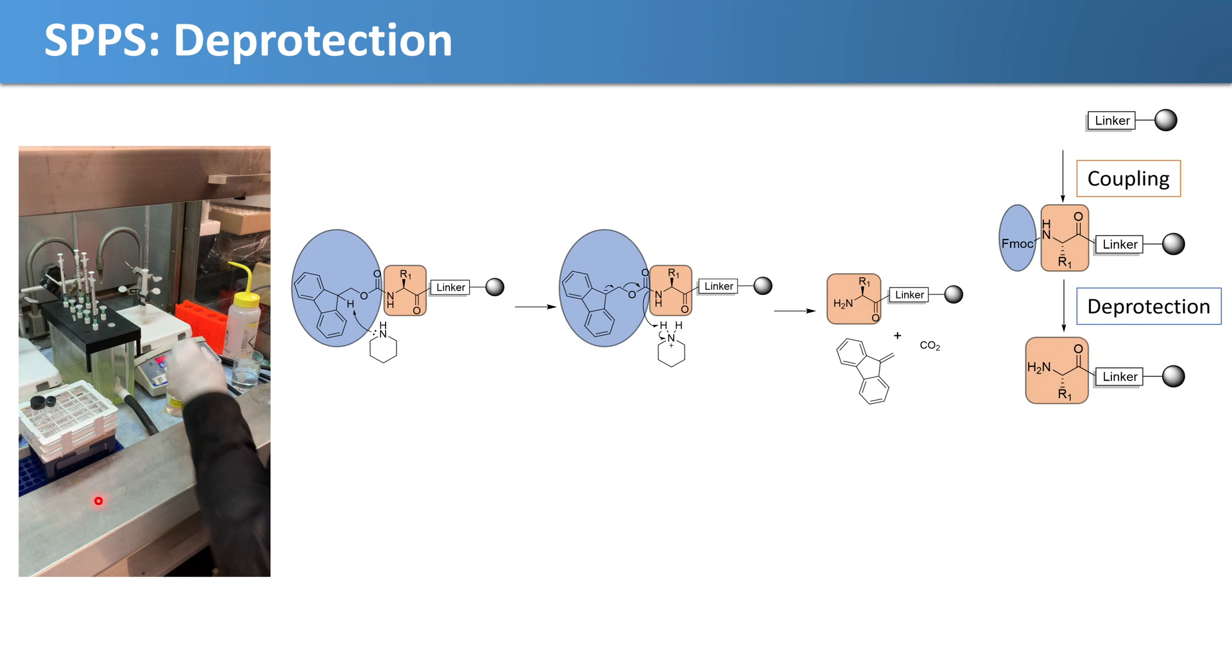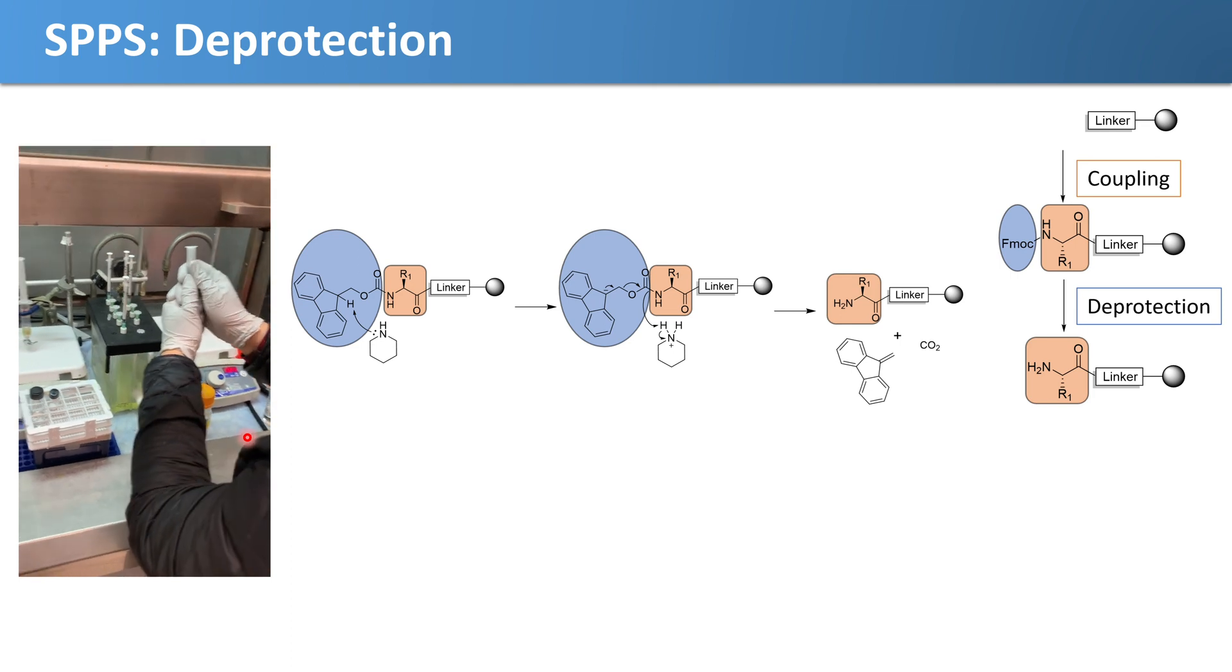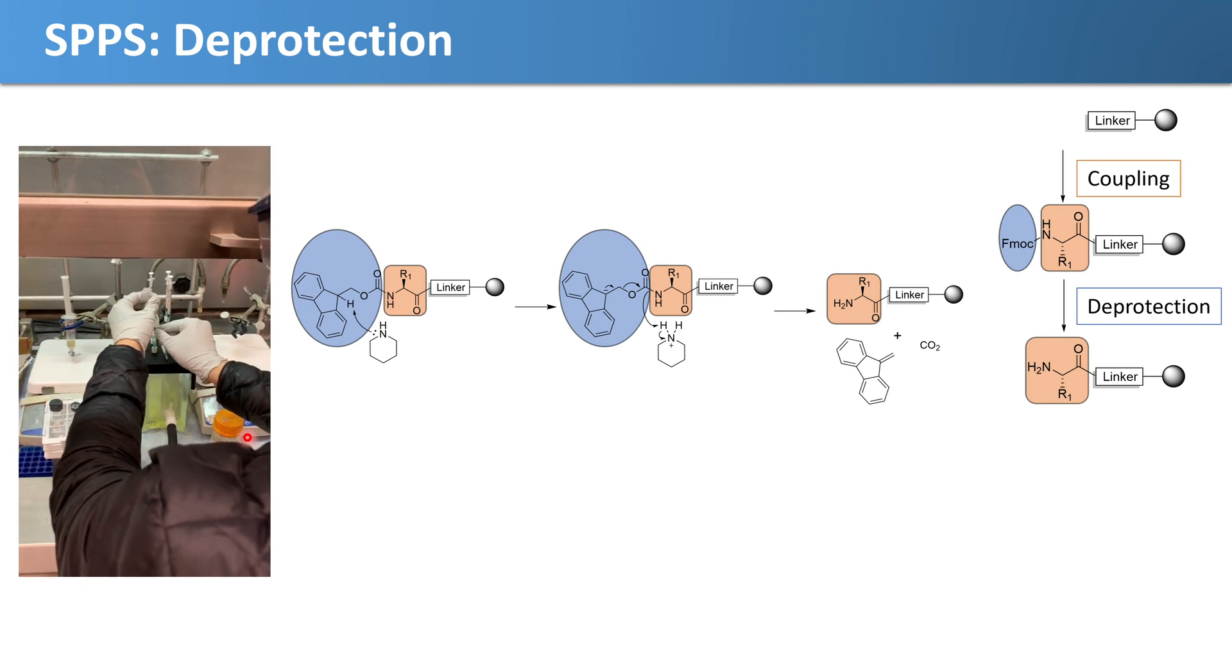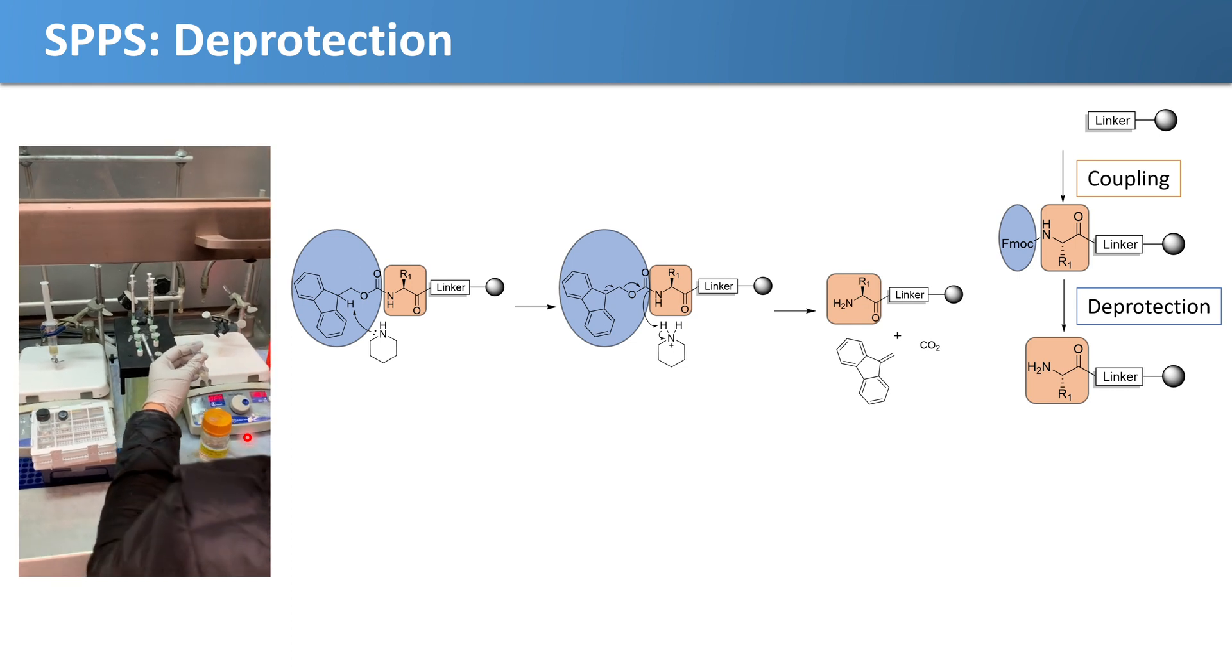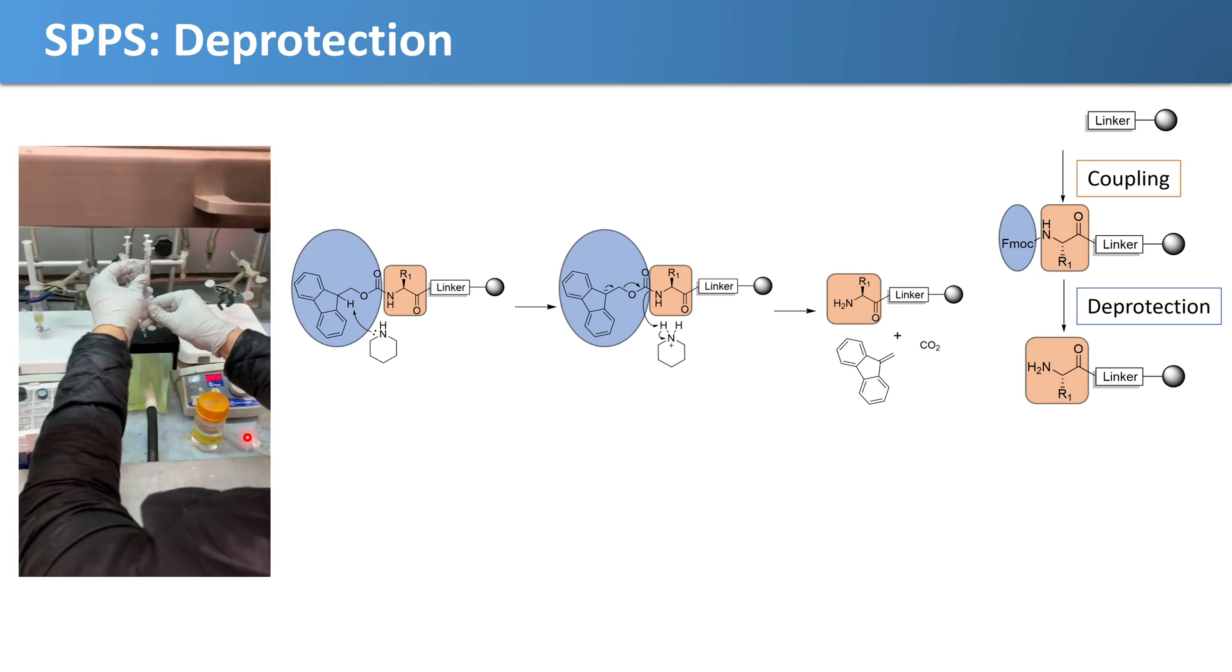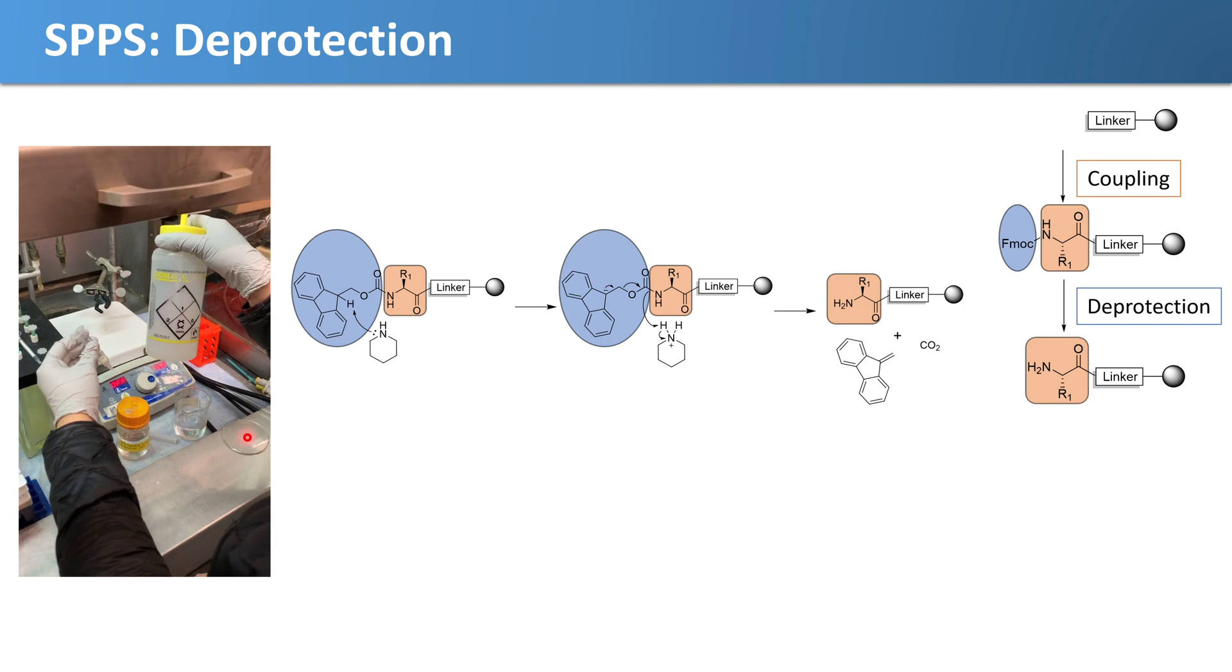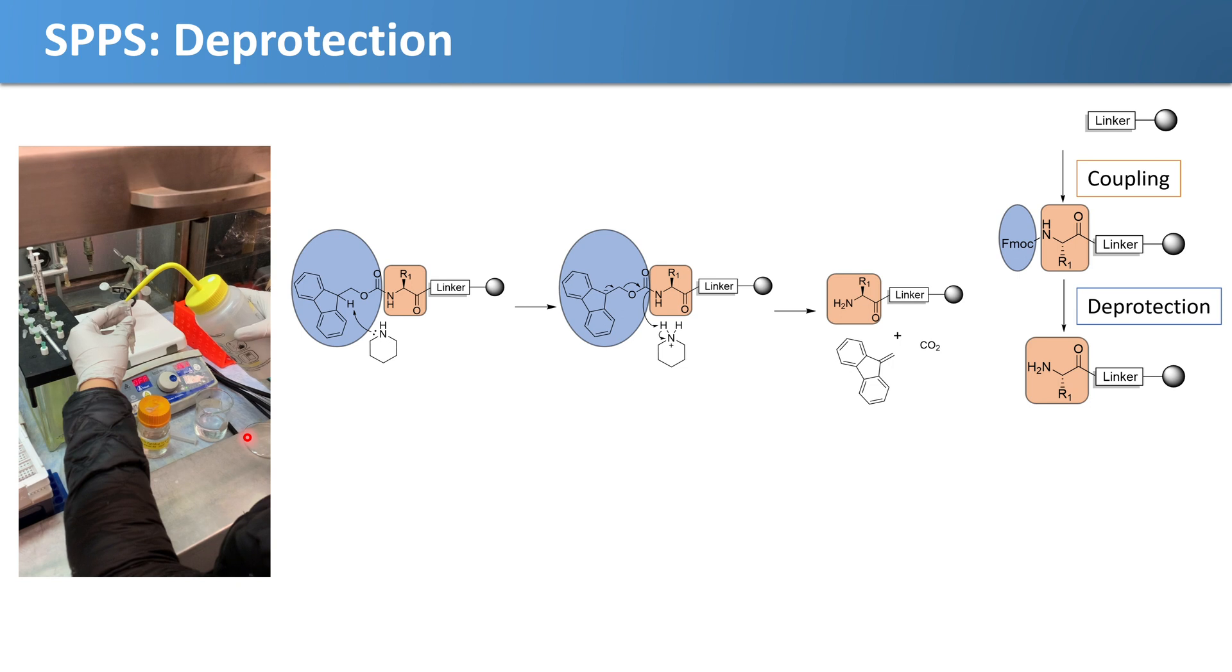In the video, this is the hood in which we do manual peptide synthesis. This is just after the coupling step. The first thing that Huangine is going to do is she's going to open up our reaction vessel and then drain the solution from it. That manifold there that she just added the syringe to has a vacuum under the hood, so it's draining our vessel. In these steps to make sure that there's nothing on the solid support and that our growing peptide is clean, she performs a series of washes. The first solvent that she used was DMF. This one is DCM.